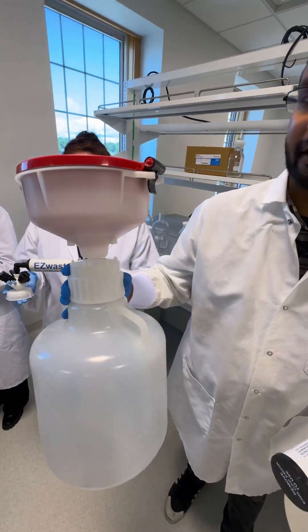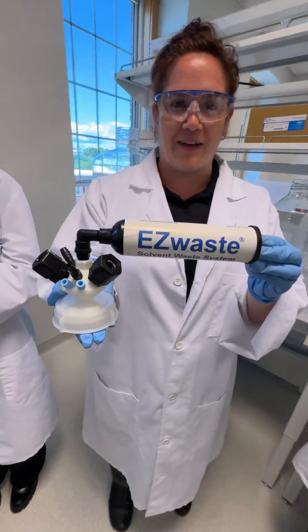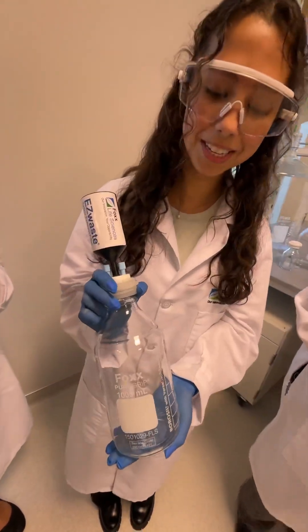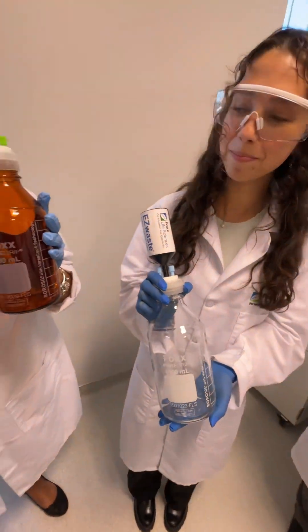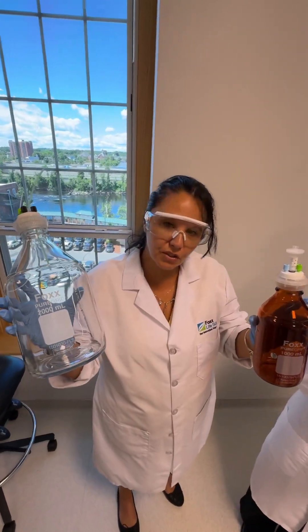Over here we have the safety funnel with the Cowboy. We have our brand new universal cap for all your connection needs, which will fit most machines. And we have our smaller EasyWaste on our 1,000 milliliter PureGrip. We also have our Fox PureGrip bottles with the chrome caps for solvent upstream.